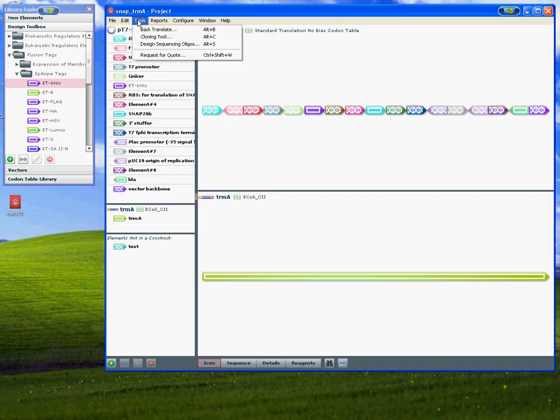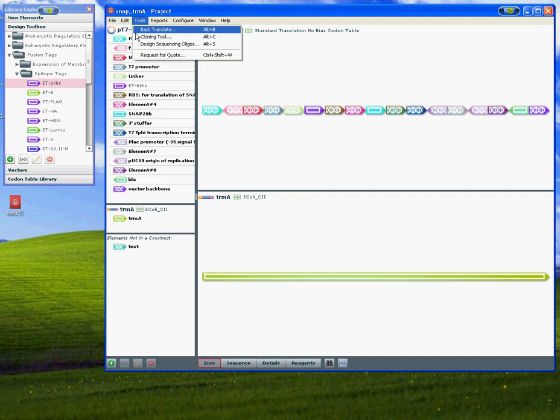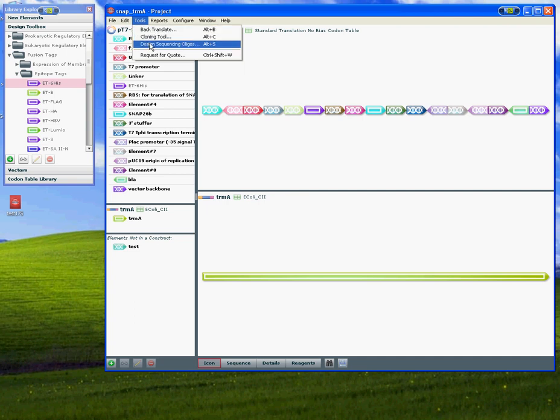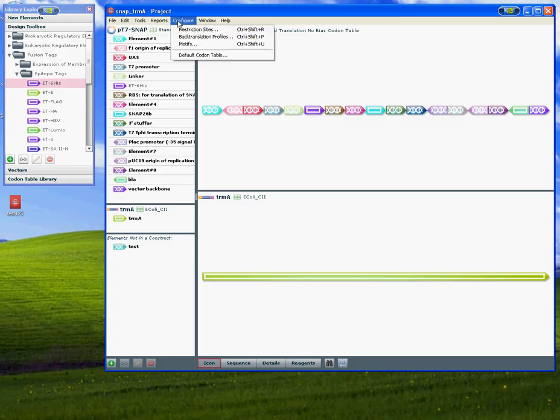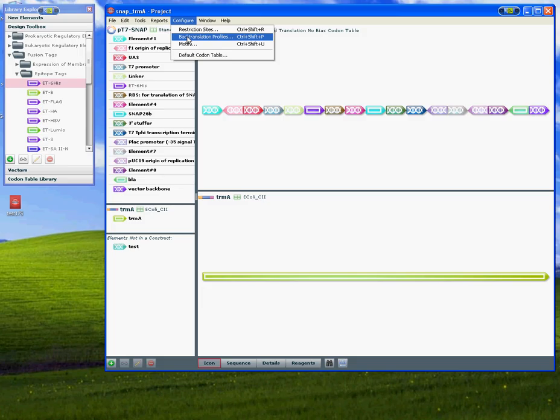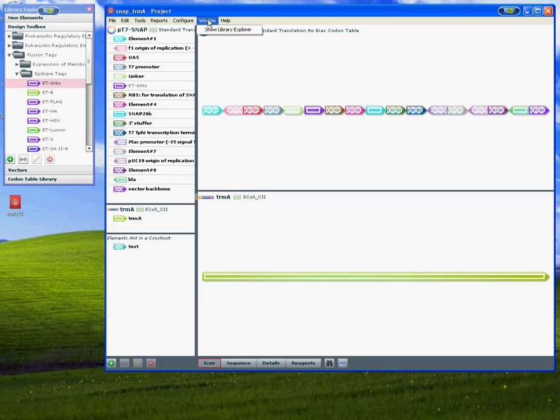In the tools pull down menu, there's a back translate tool, a cloning tool, a DNA sequencing oligo tool, and a report function. You can also use this menu to configure your restriction sites, your back translation profile, motifs, and so on.